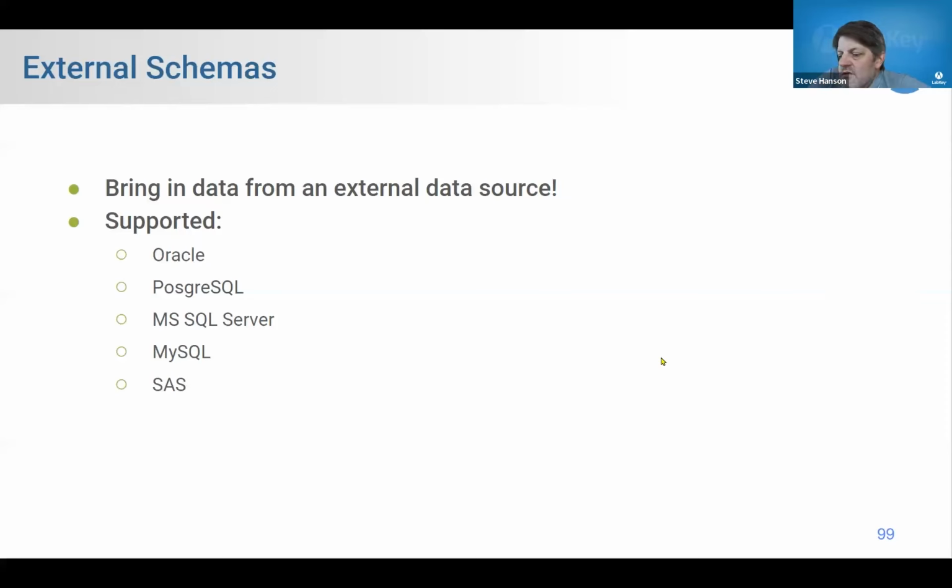Questions for stuff we did today? Anything, even stuff we did yesterday? Well, if you get inspired, write down your questions tonight, and we'll do them tomorrow. Give people a few seconds here to think of a question.